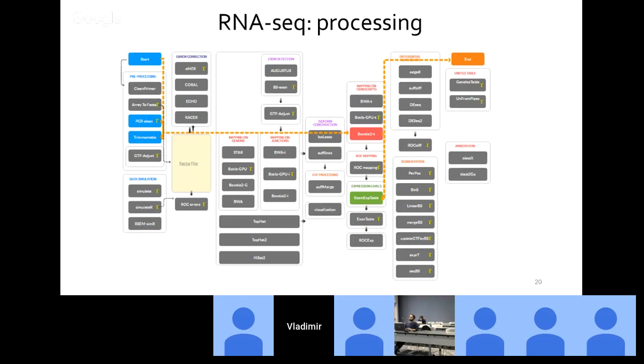Available literature shows that trimming low quality ends and even trimming adapters really improves the quality of expression level quantification, but this improvement is moderate. Moreover, removing of PCR duplicates is sometimes not desirable, as in many cases these PCR duplicates are not artificial, but there are natural identical reads.